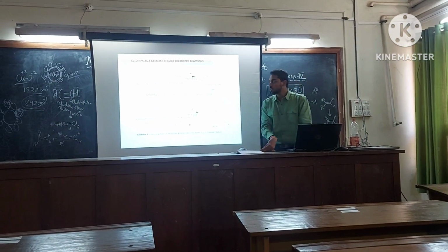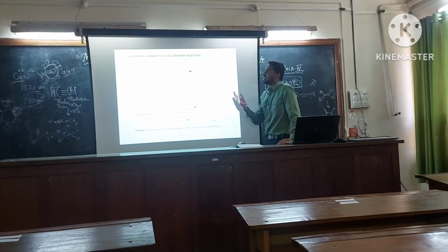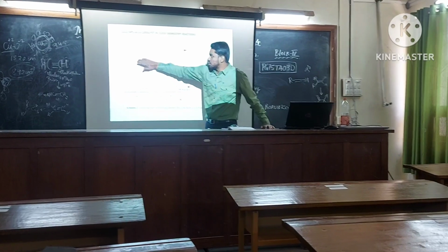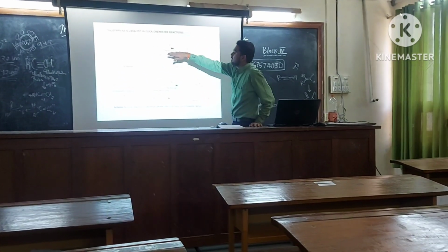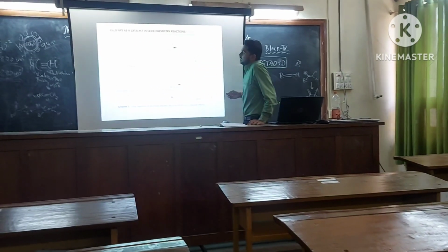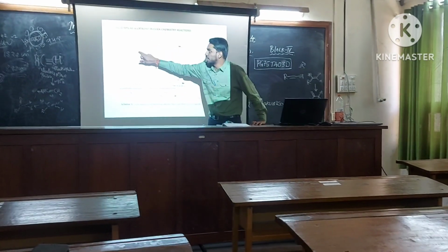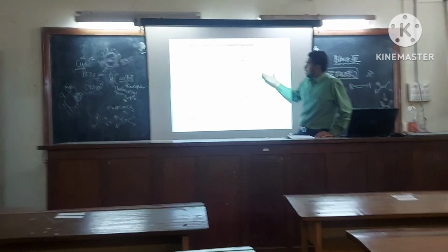So here, as initially mentioned, we have used copper oxide nanoparticles as a catalyst for our click chemistry reactions. Initially we took benzyl bromide and sodium azide, at room temperature, in the presence of THF and water in the ratio 1:1 as the solvent. So we obtained benzyl azide. It is a nucleophilic reaction. The negative charge is attacking here and we are getting the product, benzyl azide.